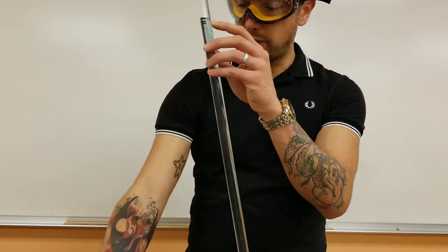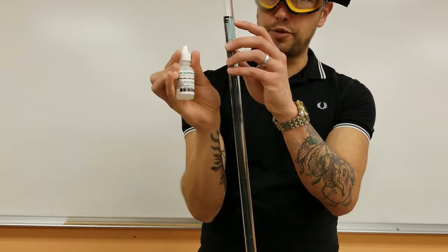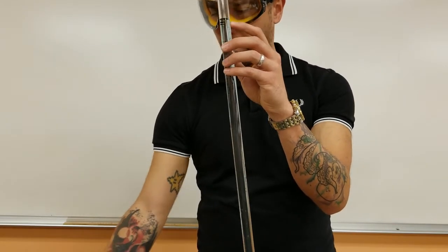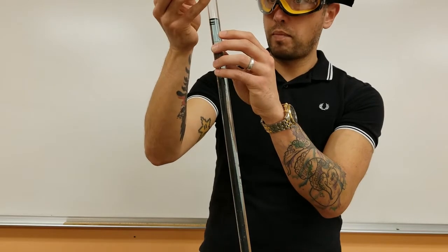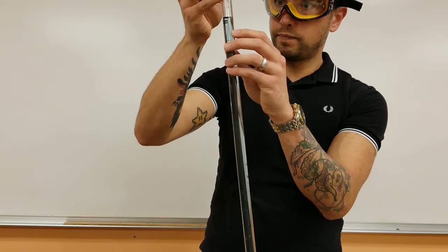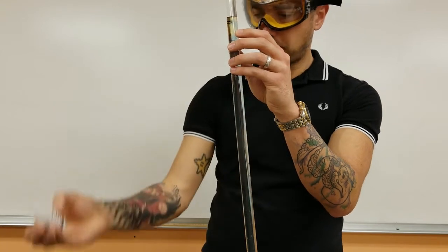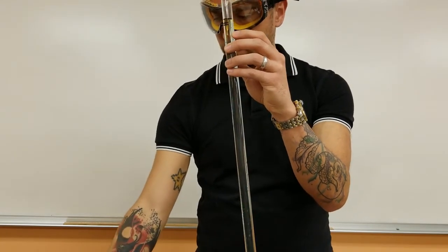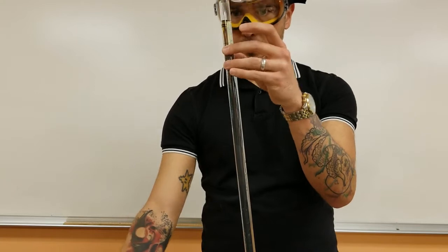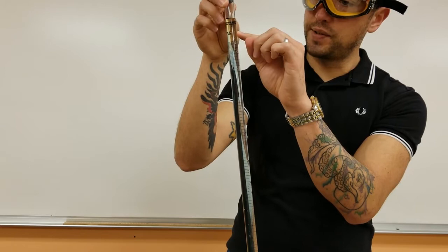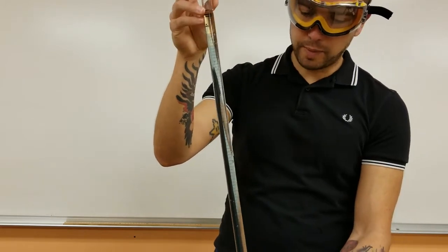In this side I'm going to put a few drops of hydrochloric acid. You can see it's started to change color, indicating acidic pHs up here. I'm going to flip it over.